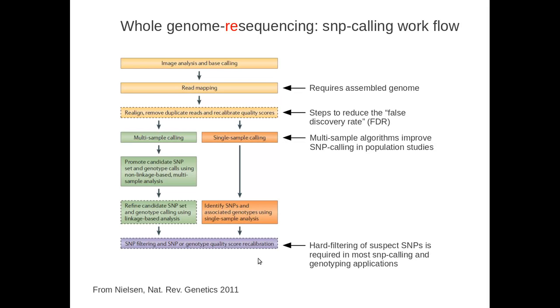And this last step here has to do with some of the steps I'll be talking about later, including SNP filtering and the advanced topic of variant or genotype quality score recalibration.